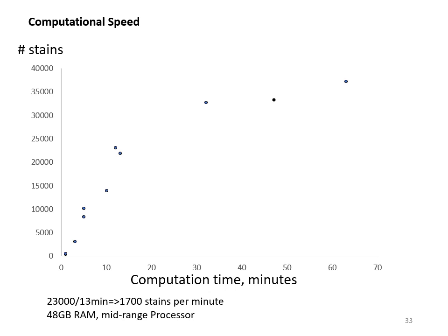So that's a bit faster than the average BPA analyst with a ruler and things. That was done on this computer, which is a mid-range processor now. It was great when I bought it 3 years ago. It has a lot of RAM, 48 gig of RAM. Octave is not great at managing the memory, so remember to get a lot of RAM if you do big pictures with a lot of stains.